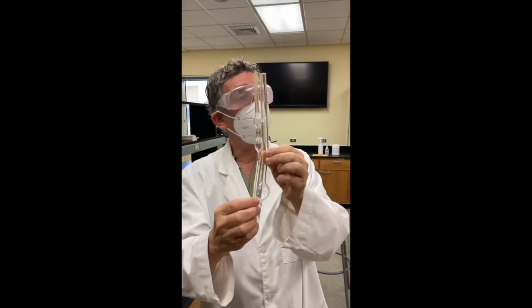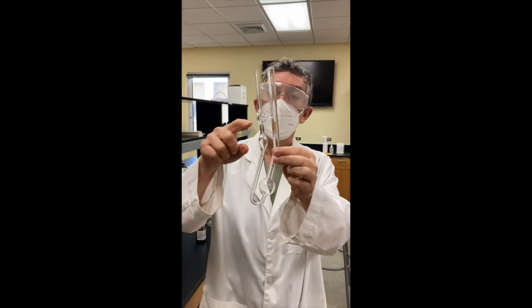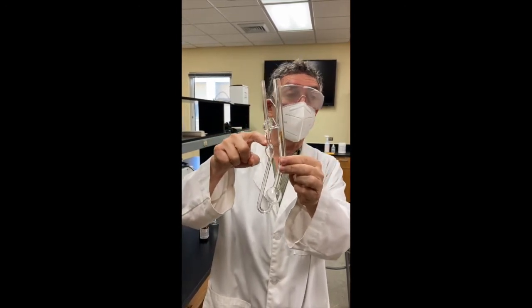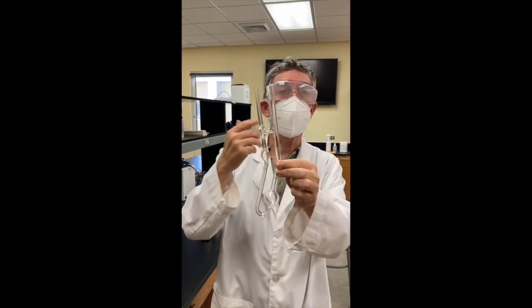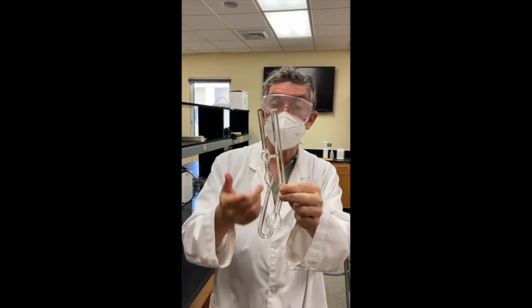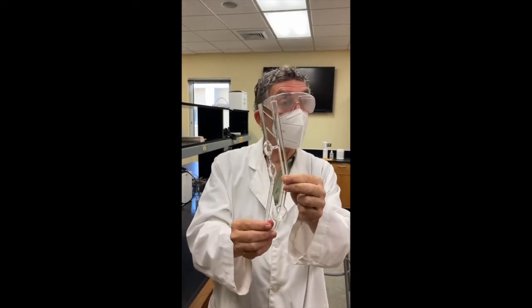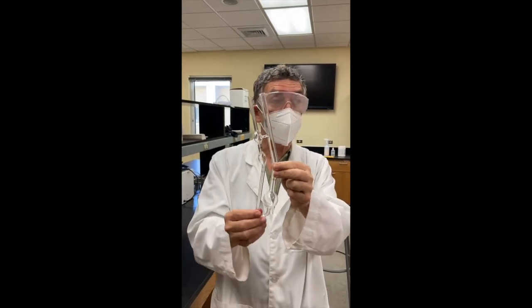This instrument's called a viscometer or a viscosimeter, either word does. Anyway, if you have small particles, they can get lodged in this bore, and you might not even notice it, but they'll make the timings irregular. You're short one time, fast the next, depending on what gets lodged in here. So you don't want the particulates, and that's why if you see them, you need to filter them out.